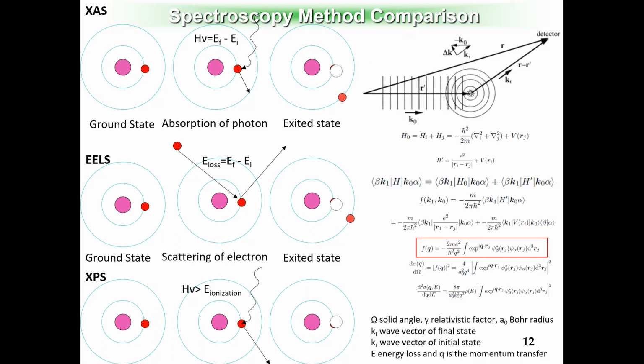Okay. If there is no instrumental level cancellation, yes, you will see the XPS for a specific element be different from the EELS, but that will be problematic because the work function is related to the instrument. You see what I mean? If you don't cancel that, then if you test in different brands of XPS instrument for the same element, you get a different binding energy, and that's a kind of artifact from the work function of that instrument. So that's why we have to cancel that part. And once it's canceled, it will be a similar energy range as the EELS. Okay, thank you.